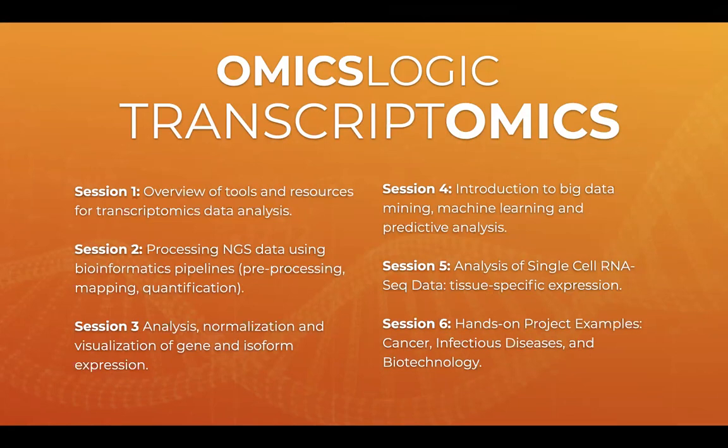Now, today we'll look at some of your submitted projects, and we'll discuss how mapping is an important step, especially when you're dealing with non-model organisms and when you have some variation from maybe the most studied species used in the reference. So we'll talk about some of those challenges of mapping.